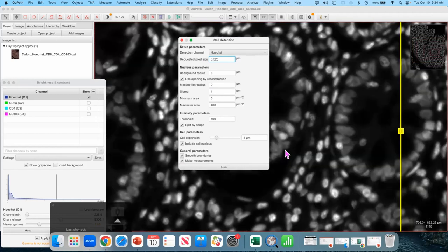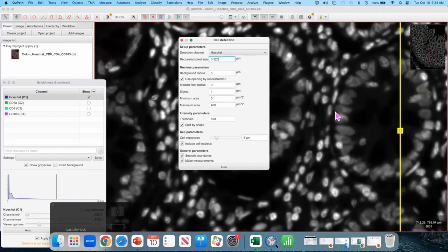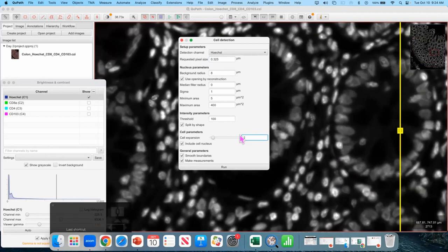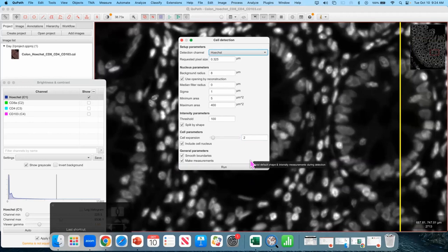And because these are, the cells I'm most interested in are the lymphocytes and not the epithelial cells, enterocytes. The lymphocytes are small. The intestinal cells themselves are large, but the markers are the lymphocytes. So I'm going to drop my cell expansion. You don't have to use these exact settings. I really encourage you to try it yourself, play with the settings, see what happens.